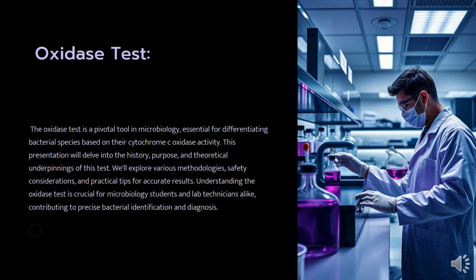Good morning, dear students. Today we are going to discuss the oxidase test. I already put a video on that, but I felt that this needs more explanation, so I made a better PPT. So let's start discussing.